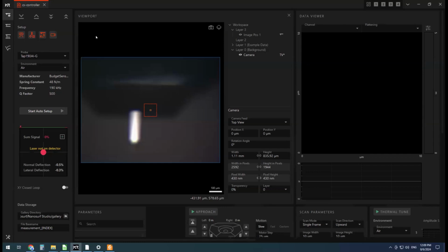Today, I'm going to be covering the Nanosurf Drive AFM. I thought it would come in handy to do a live demonstration to serve as an instructional video and hopefully get some more people interested in the AFM as well and what it can do. So we're going to cover imaging today as well as some indentation curve analysis for some mechanical tests.